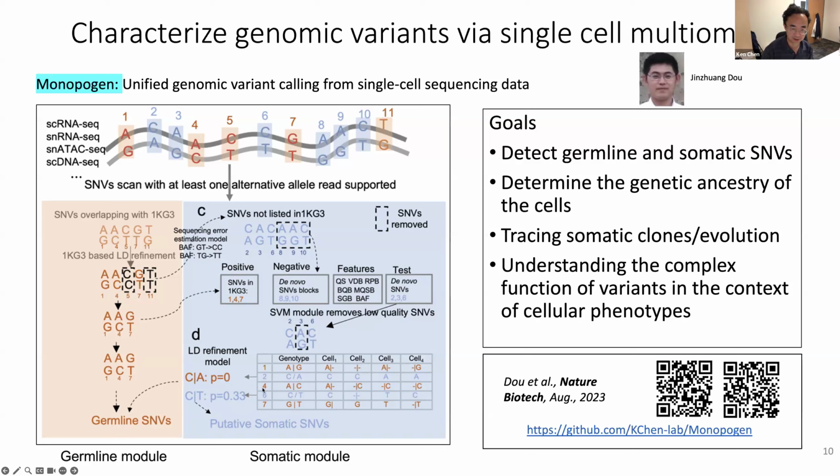So we use those statistics to help us compute somatic scores, which help us eventually distinguish germline from somatic variants. Those parts probably deserve more detailed discussion if you would like, and we're happy to follow up with you to do that.